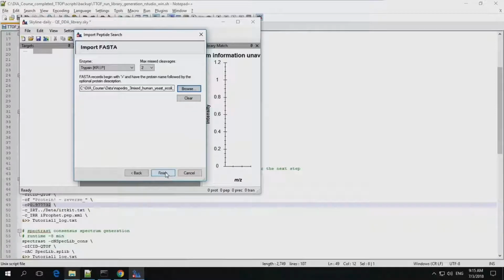And everybody here? No? Okay, well, go ahead and click finish because it'll get started and take a while, but I'll sit on this page for another second for people to catch up. Are people on this page trying to find the FASTA file? If you're behind, how far behind are you?